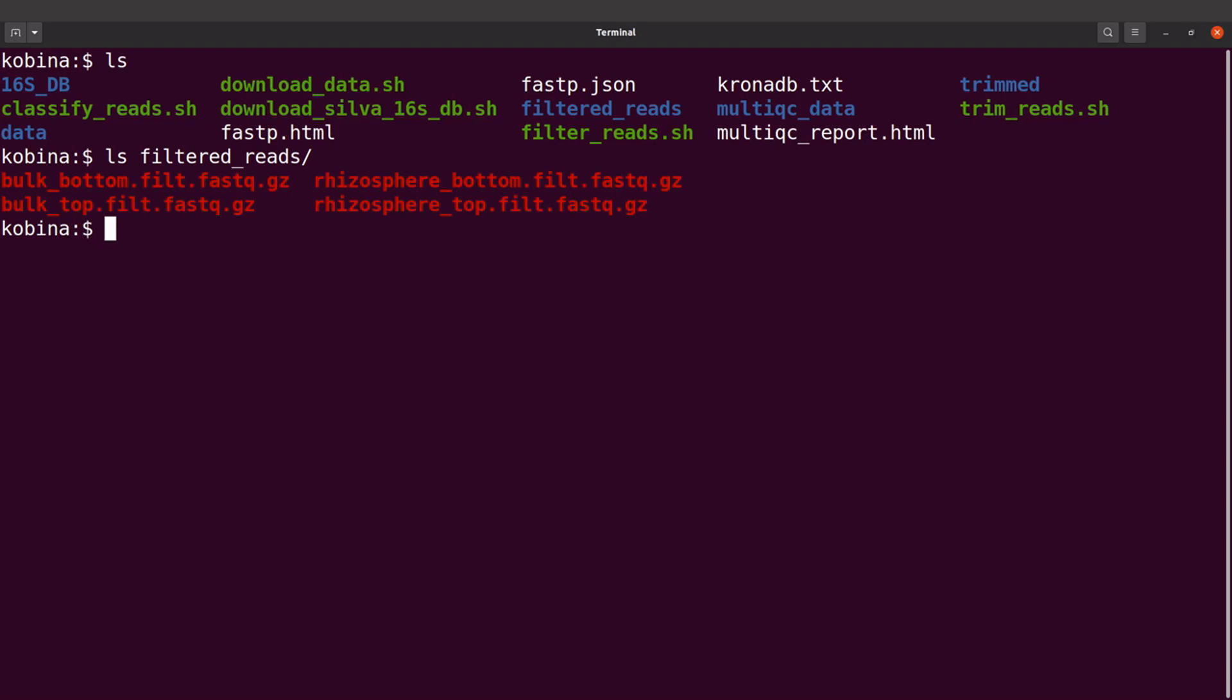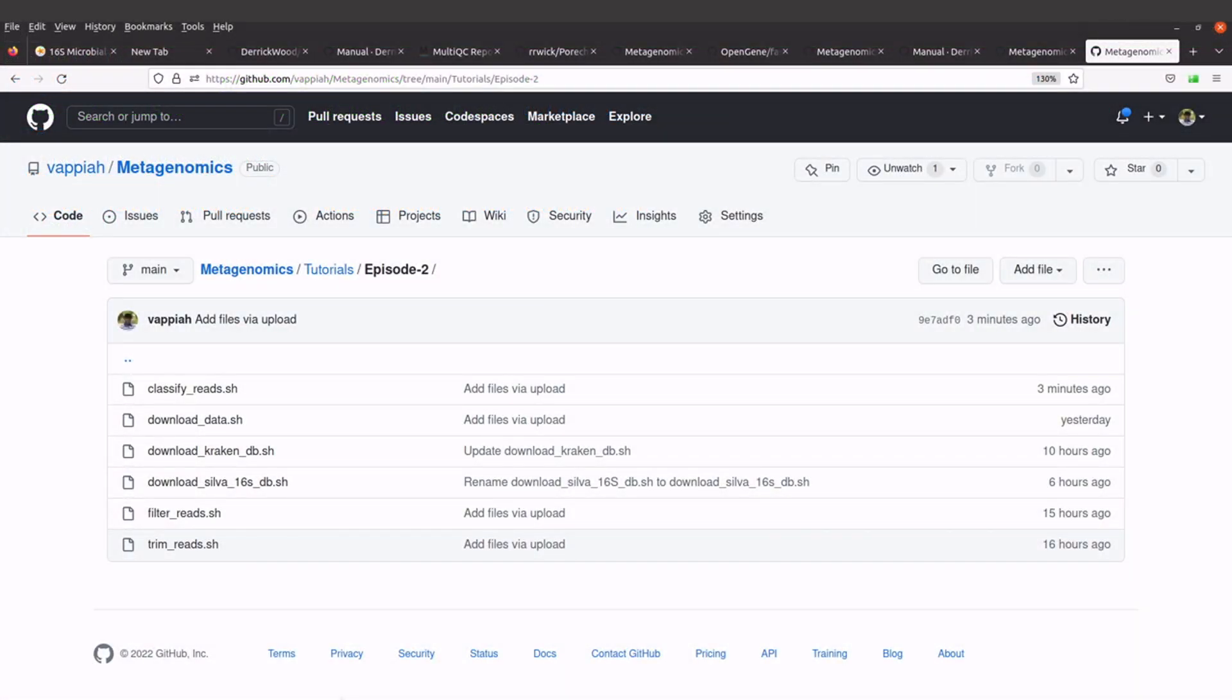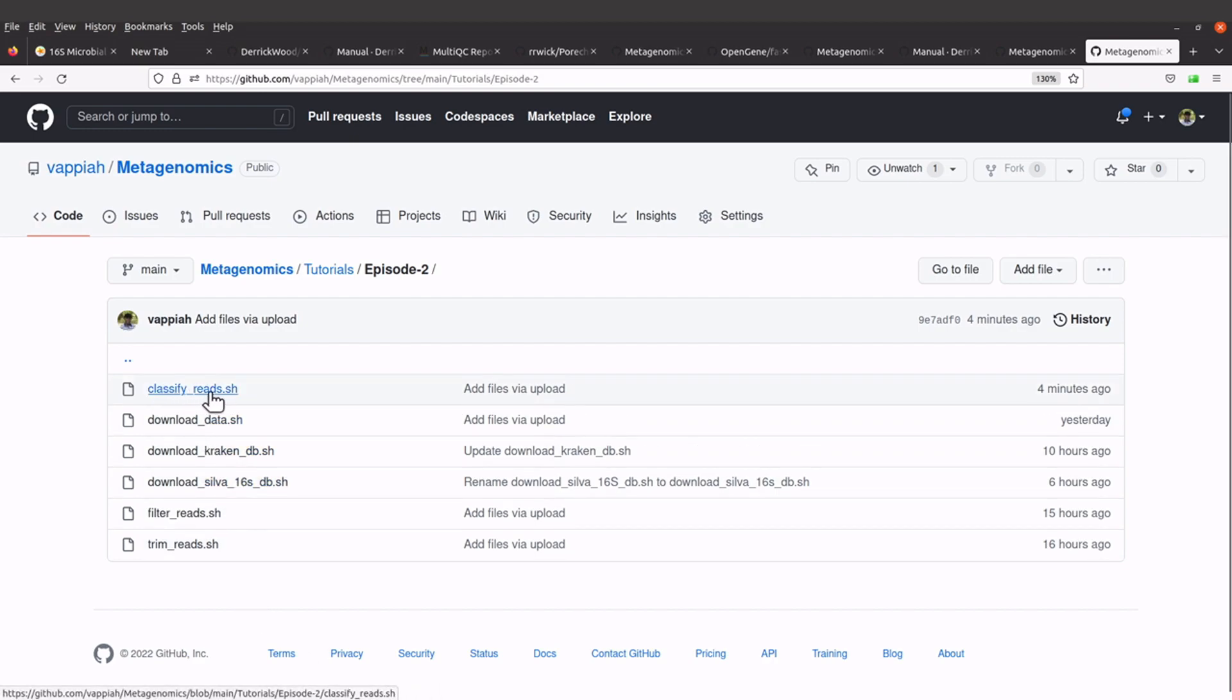Let's go to the GitHub page and then I'll show you the script we are going to use. On this page, just search for classify_reads.sh, this file here, and then click it.